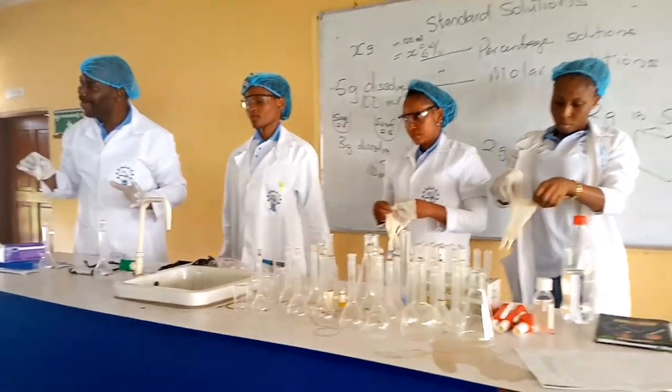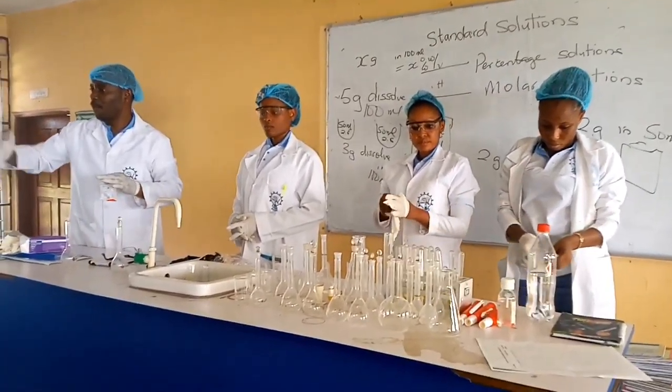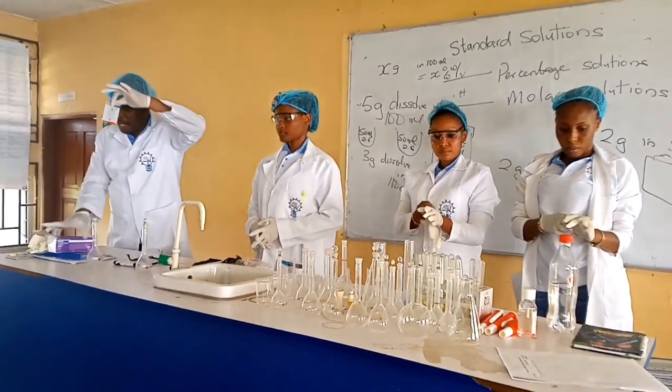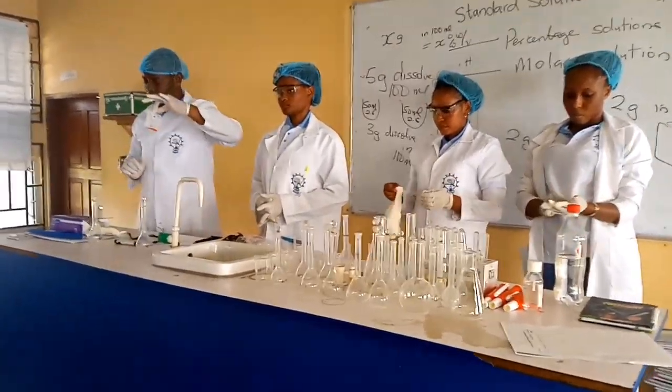So when you dissolve X grams in 100 mil, for example 5 grams, do we all know how to weigh? No. Yes. Alright, let me explain it to you, because it's not part of what we are going to do today. Now, look at this. This is a weighing balance. You know what they call a weighing balance? Yes. Good.